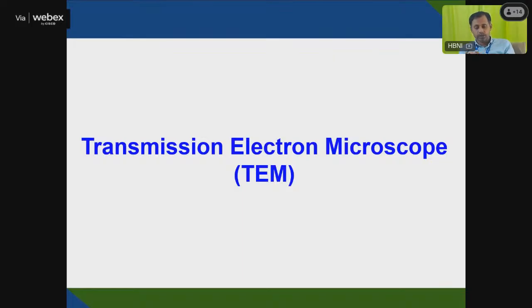That I am not discussing, the focused ion beam, which is mostly used for metallurgical samples, that SEM with FIB facility. So you can get the crystallographic orientation, in which direction, and all those things. So similarly, SEM uses the scanning electron microscope, mostly the two electrons, secondary and backscattered electron. There is another electron, as I discussed, the transmission electron. The transmission electron is used in the transmission electron microscope.